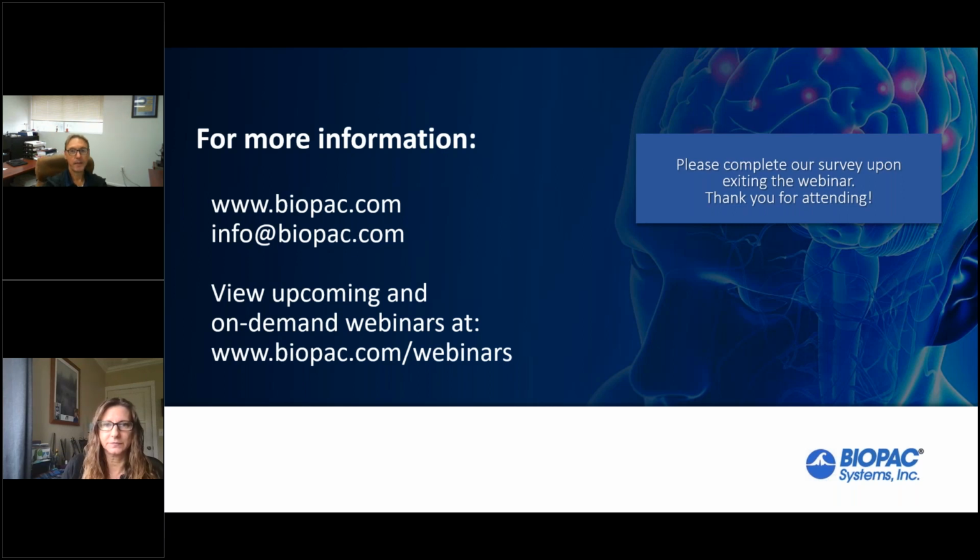No, I think that sums it up quite nicely. There is another webinar that we ran on workflow. The first one gives you a higher level view and shows you the workflows in action. This one, I attempted to break it down a little bit more and provide more of a training vehicle for people. So hopefully between the two, you'll find something that's appropriate for you.